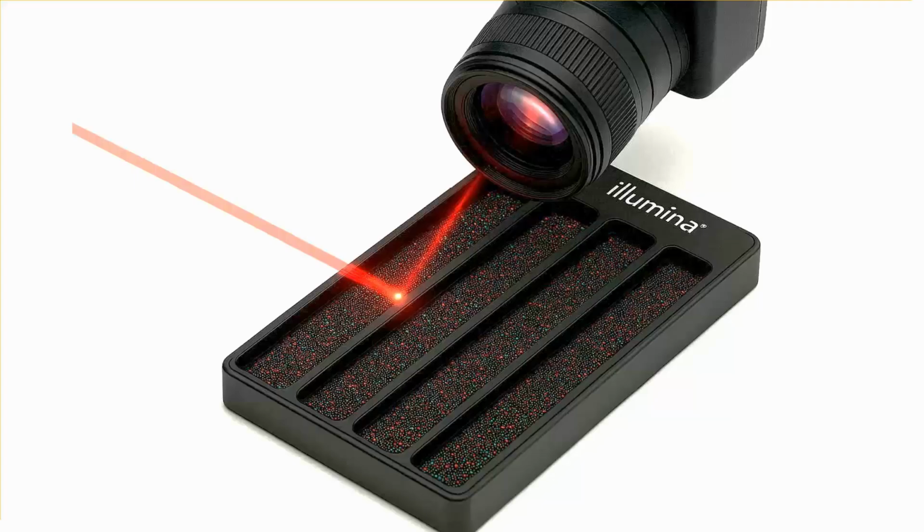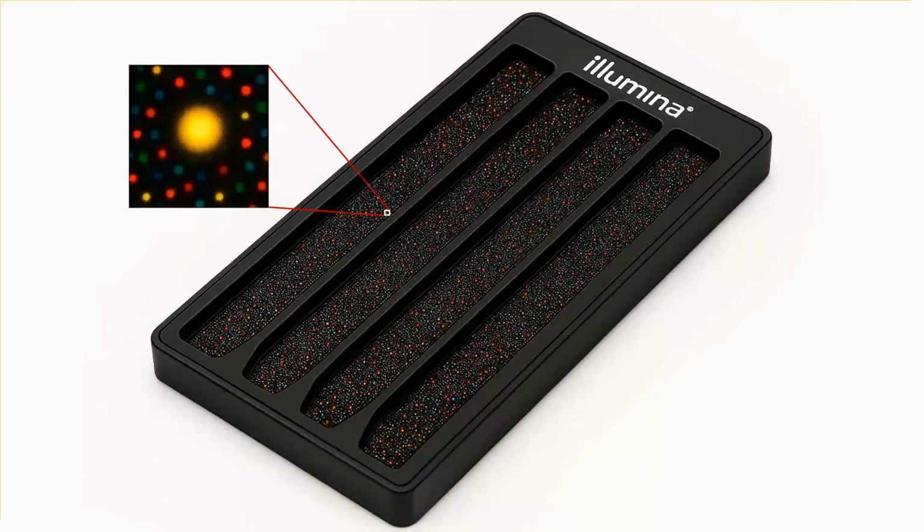The instrument captures 4 distinct images of the flow cell using 4 different wavelength channels corresponding to A, T, G, and C signals. Each base A, T, G, and C is detected in a separate channel within the same cycle image. The emitted fluorescence is separated into 4 wavelength channels and recorded as 4 images per cycle. From this image, the instrument identifies the incorporated base at each cluster position.